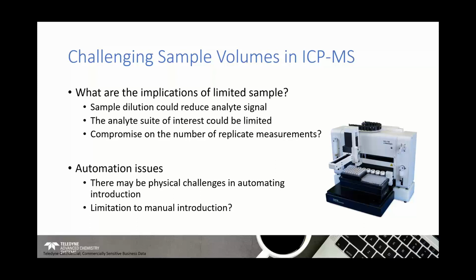So dilution and reduction of analyte signal is a real potential problem in this kind of situation.